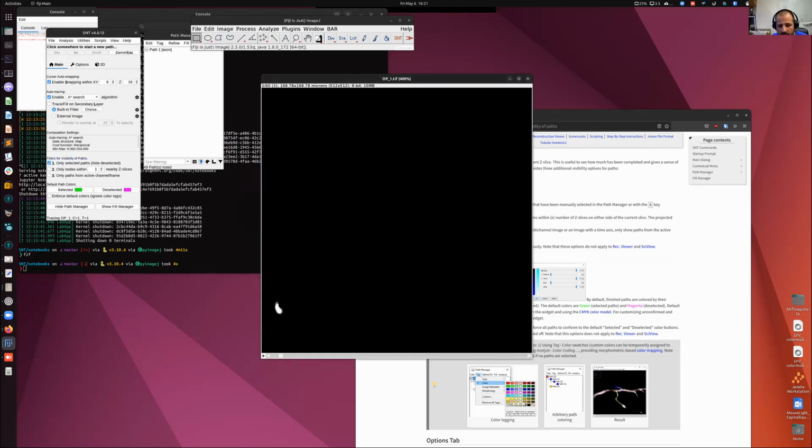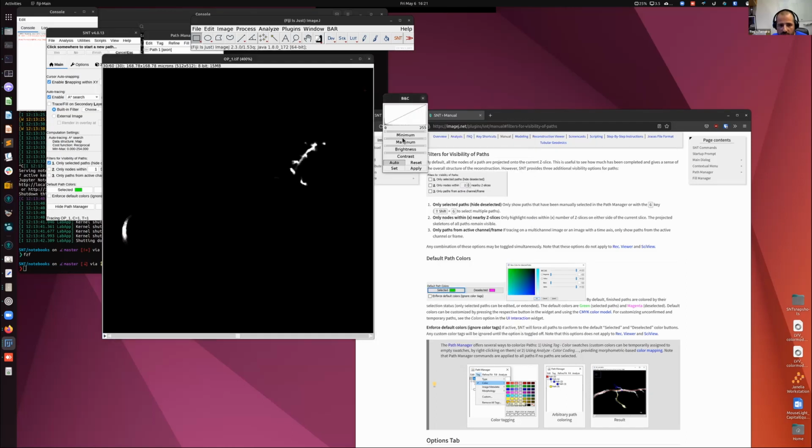So you can see that we can adjust the brightness and contrast, or I can change the lookup table for you to look, but you can see that there is almost no background. For the most part, it is almost a saturated image. Not all images are going to be like these.